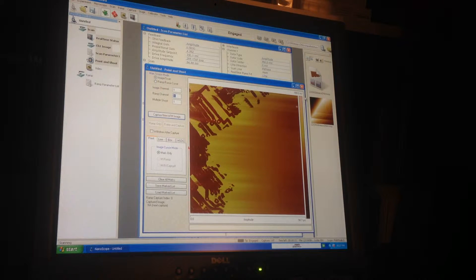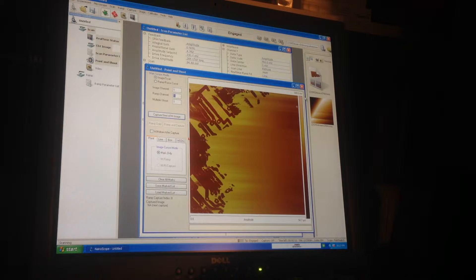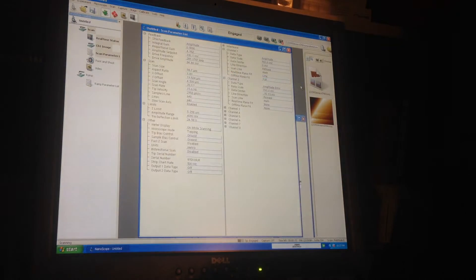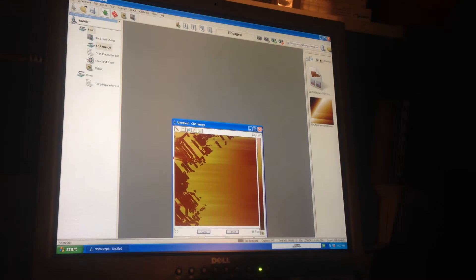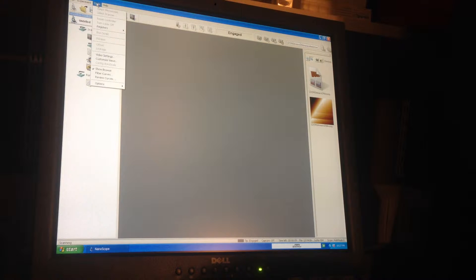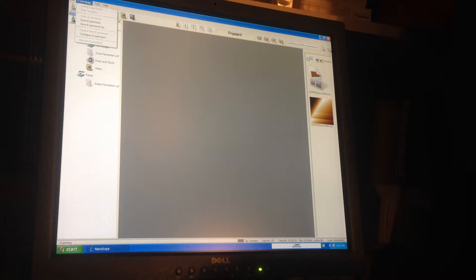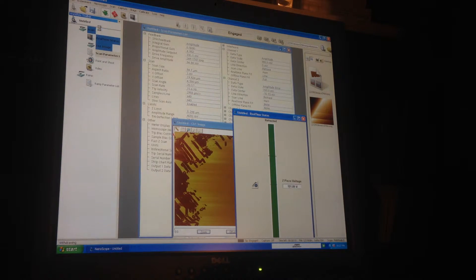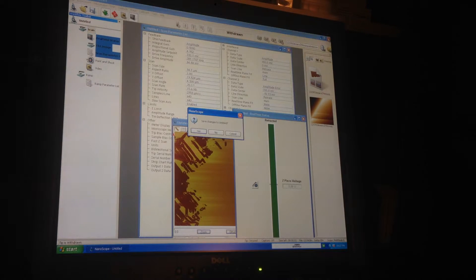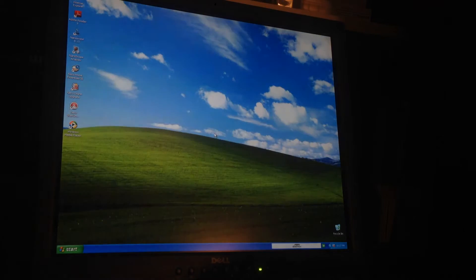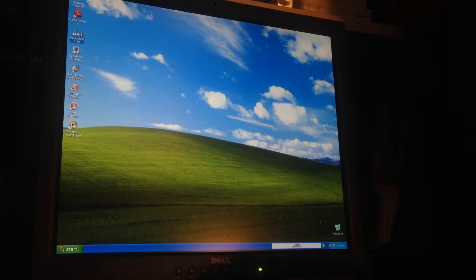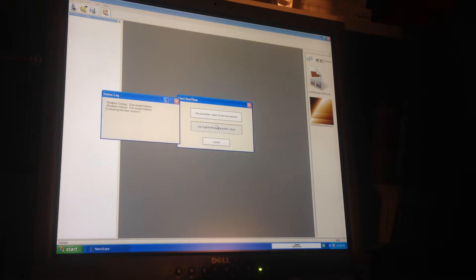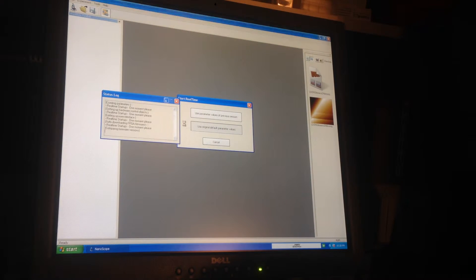It seems to be working, so just on the software side I'm going to go back and just see if I can rerun the experiment. If I withdraw the tip, let's use the default parameters and let's see if I can get this working again on video.